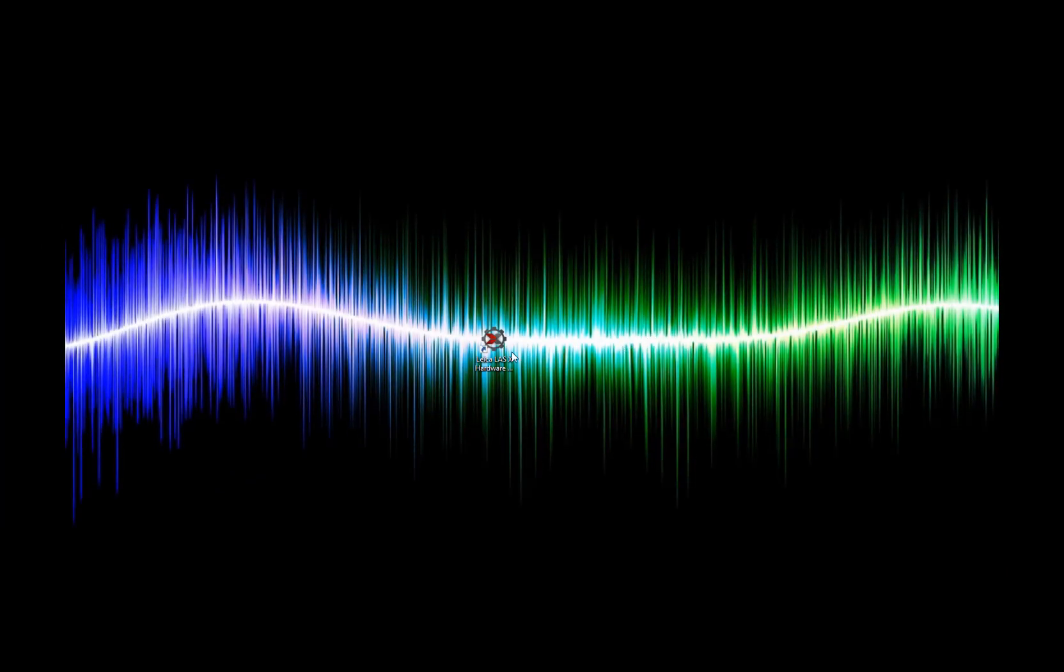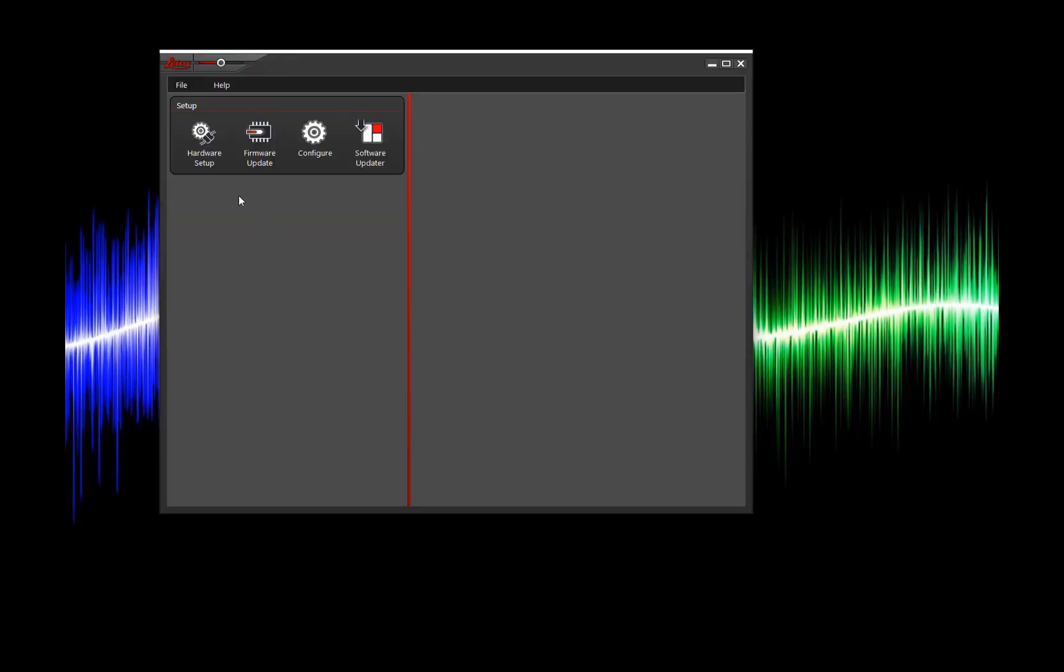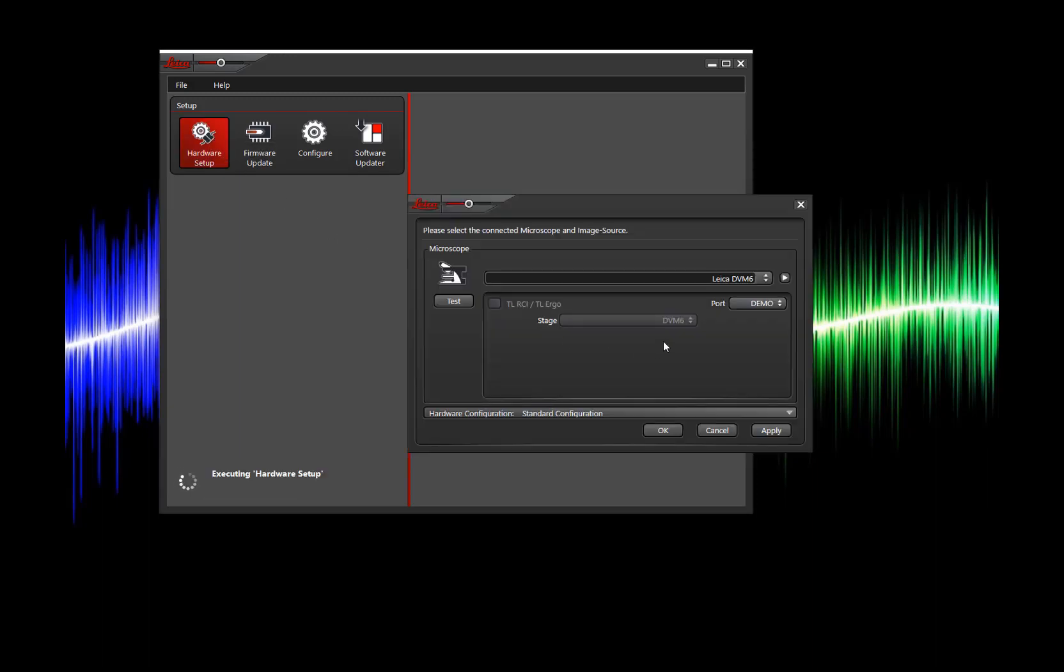Now that my computer is fully restarted I'm going to open up my hardware configurator. From here I'm going to go to my hardware setup. I'm going to confirm that everything looks correct for my current microscope system. In this case I'm using our DVM-6 demo.